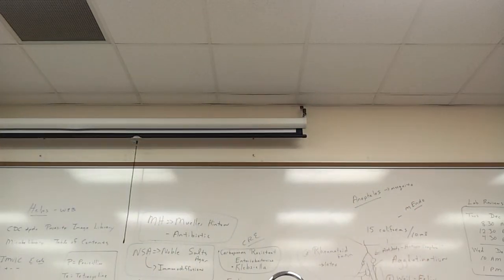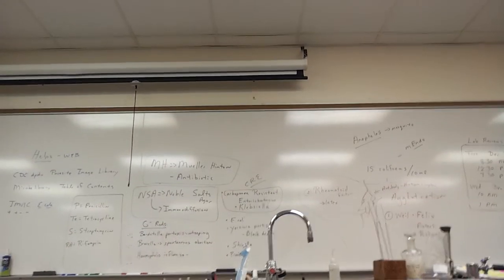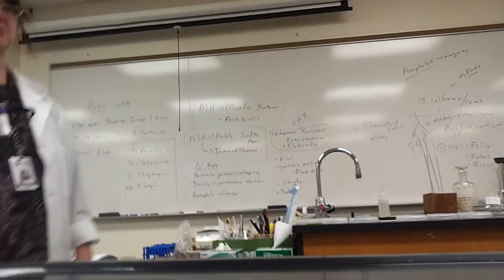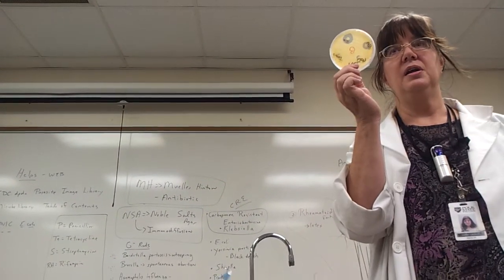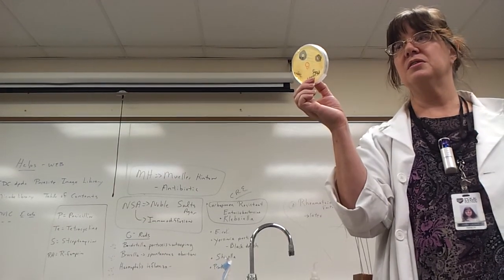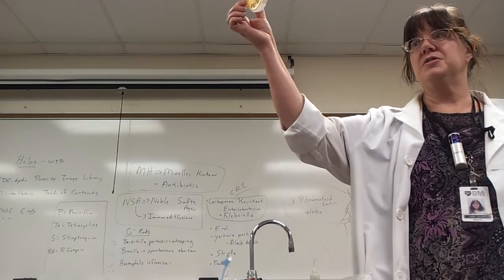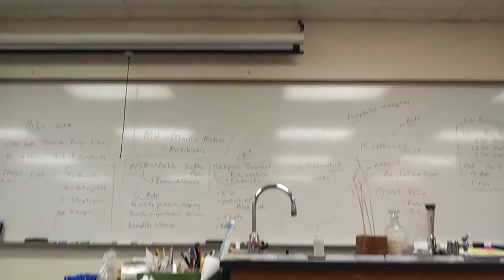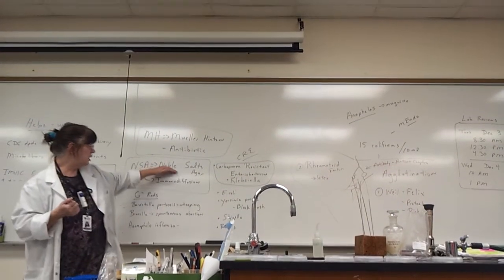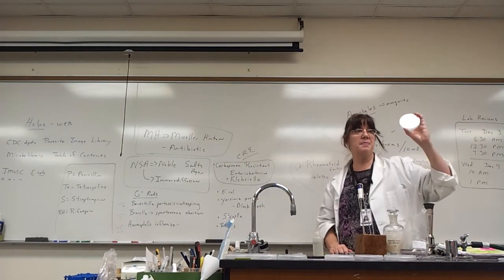Okay. So on this plate, it would be like A, B, C, and D. The organism is most sensitive to which chemical? You would put A, B, C, or D. The organism was most resistant to which? A, B, C, or D? Well, in that case, if that was D, yes. Does that make sense? Okay, because I want to be sure nobody gets confused on that one. Now, for the next one, that's a different plate. Yes, go ahead. What plate was the last one?